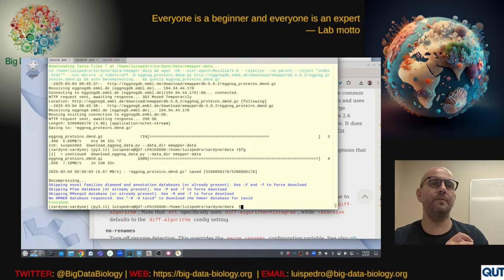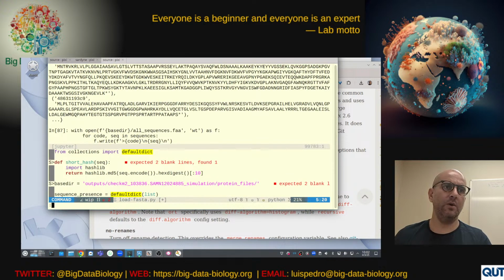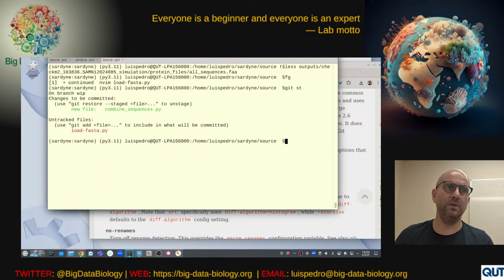Which is a bit unfortunate. Alright, we'll do that next week. I wanted to get this done this week where we would get eggnog mapper to at least run. Did I now mess this up a bit?